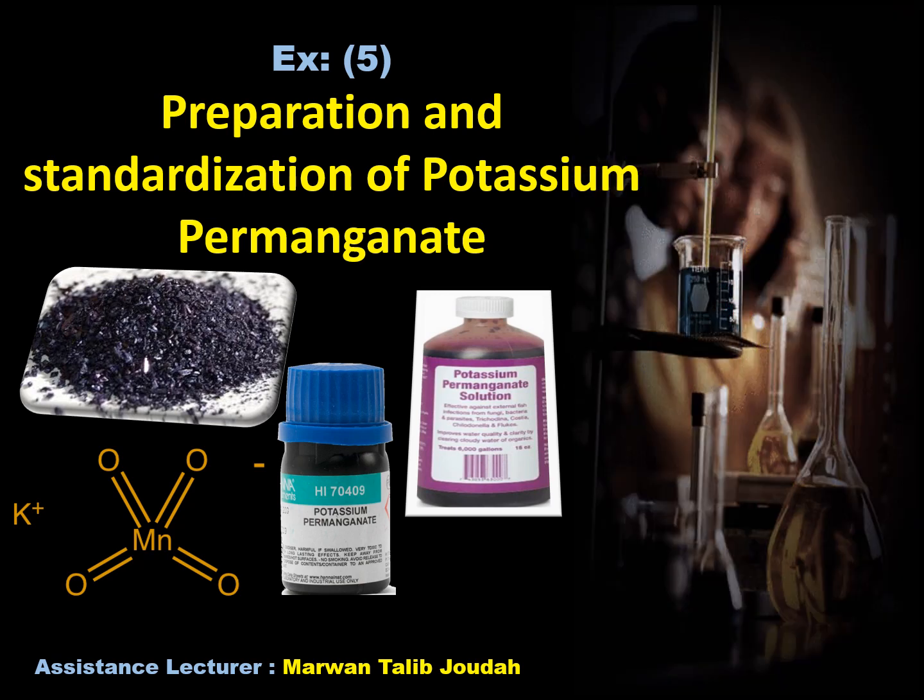اللي راح نتكلم عليه اليوم اللي هو Redox reaction، يعني titration راح يصير بعملية oxidation and reduction at the same time، يسموه Redox reaction. بالنسبة للpreparation and standardization of potassium permanganate اللي هي التجربة، راح تشوفون البوتاسيوم permanganate. I don't know if you have heard of this compound. يستخدم as a solution وإلى medicinal or pharmaceutical uses هواية، فراح نتكلم عليها ونعطيكم بعض الأمثلة عليها وراح نشوف شلون نسوي التايتريشن.